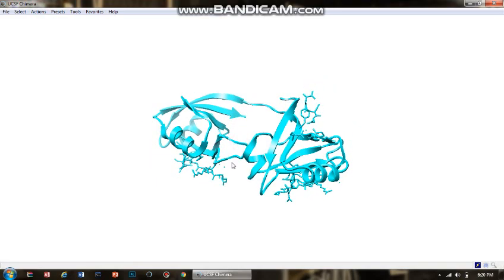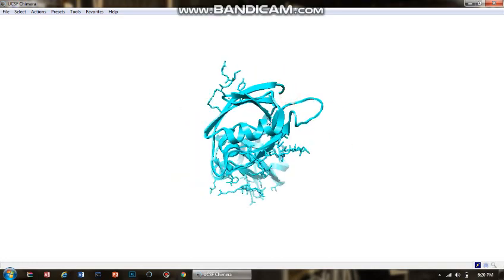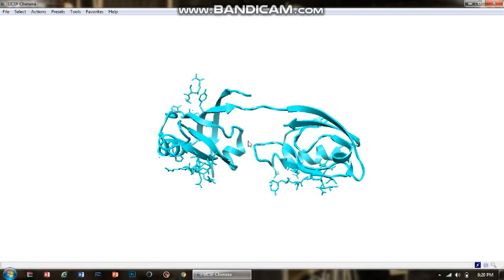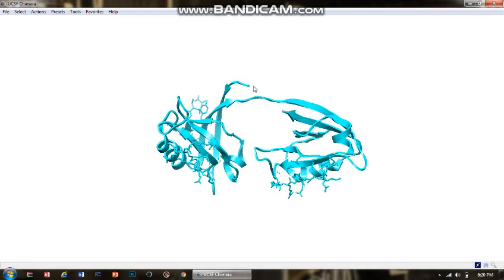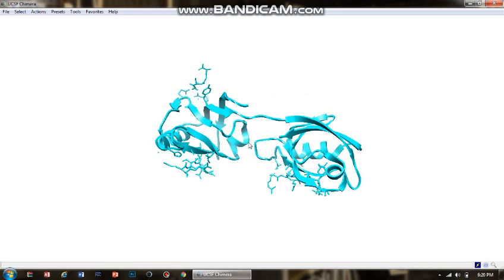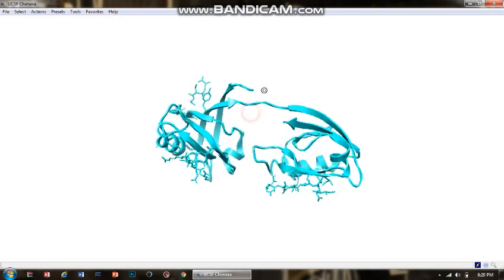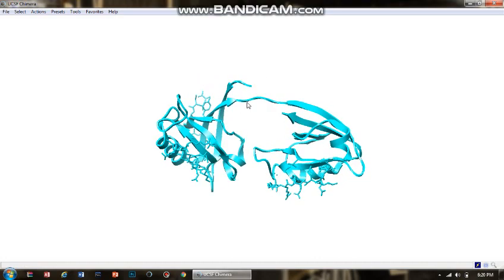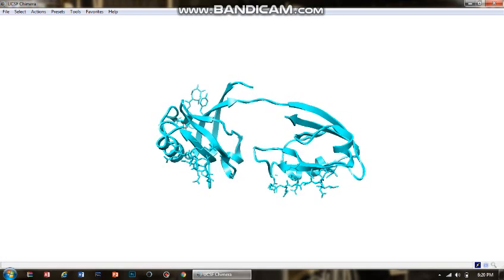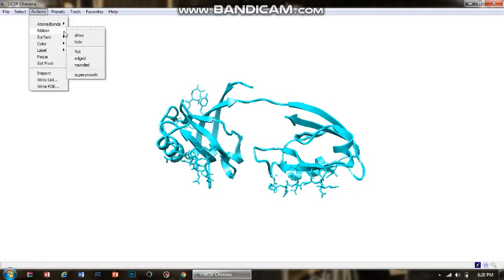If we go to the edge representation, you can see it is a bit more sharp. This representation gives a sharper effect — it feels like the core of the protein molecule is enclosed in some kind of grid. It focuses on both the width and the height to enhance the overall representation of the molecule.